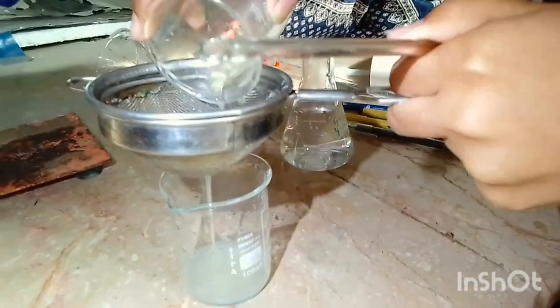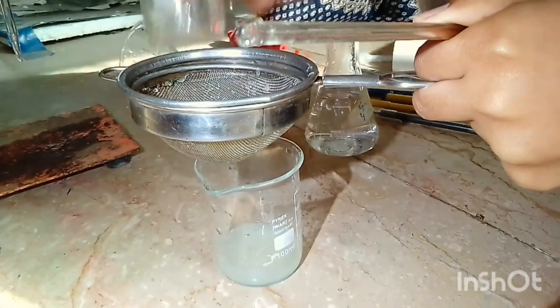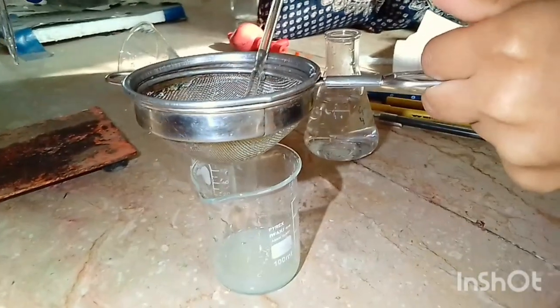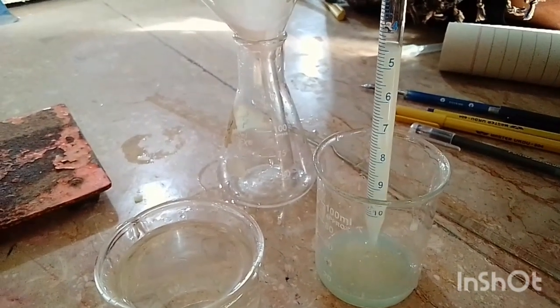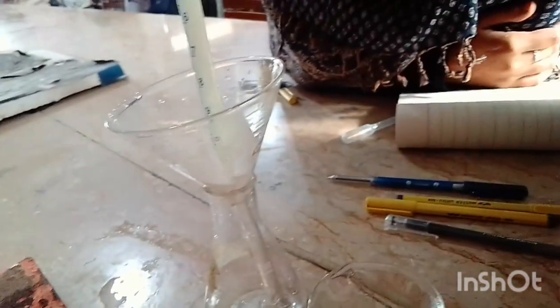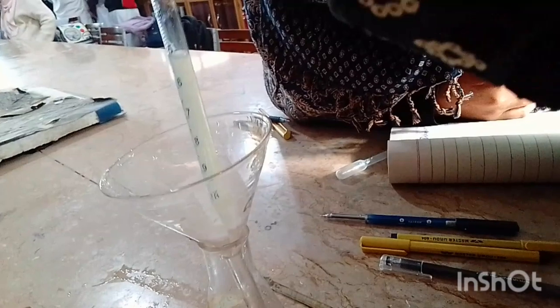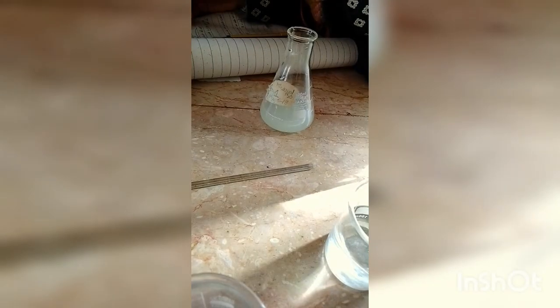This strainer will help us to remove the pulp. The pulp will remain on the strainer, and in the beaker we have the extract. Now we will perform filtration using a filter paper — you can also use a Gooch crucible — to get a very clear extract solution.